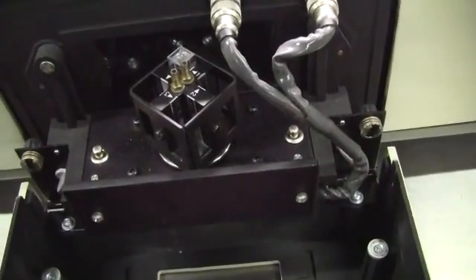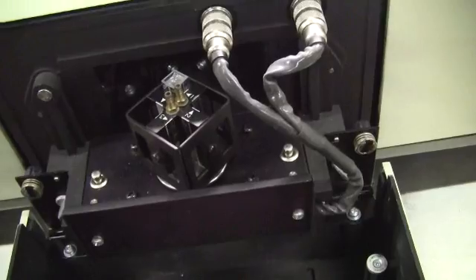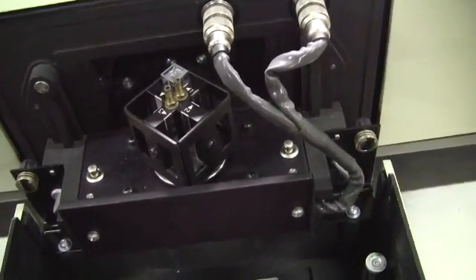This particular unit has sample cells for four samples — a four-sample cell holder.